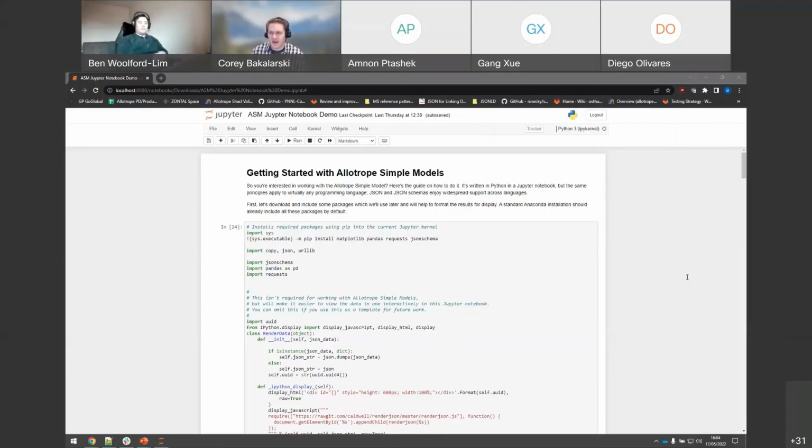I might have misspoken, but Christian was asking about converting ADF, the Allotrope Data Format, to the JSON Allotrope Simple Models. Yes, you just talked briefly on that aspect of converting the different data instances. That was what I was talking about. We have a tool to convert ADF files, data files, as in, here is a chromatography experiment result from ADF into ASM. But you're right, I should clarify, because ASM is built on the tabular models, this tool only applies for data in a tabular model form, and specifically an Allotrope tabular model form.